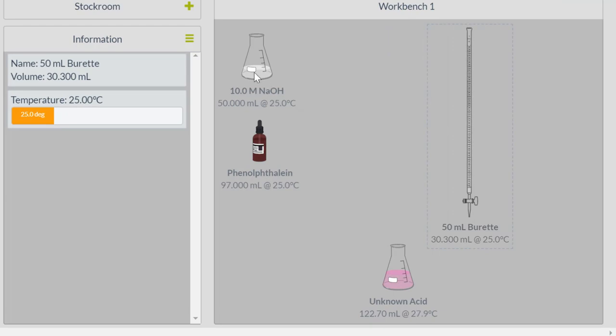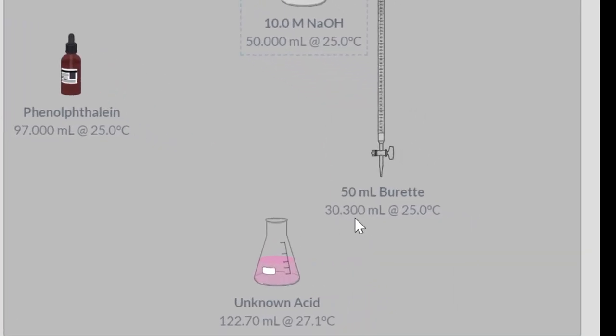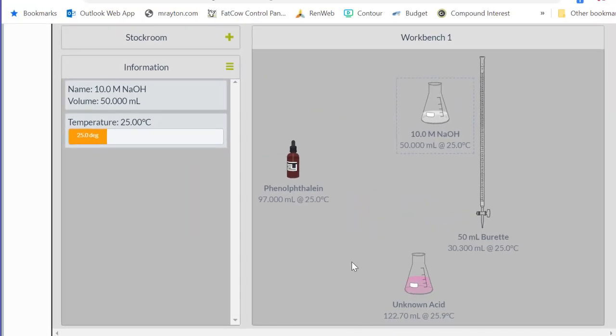You can see my 10.0 molar. I started at 50.0 milliliters, and it has gone all the way down to 30.3 milliliters. Which means you can find your change of volume of your 10 molar. I have hit my end point of my 100 milliliters of my unknown concentration. So your job is to find out the unknown concentration of your acid from your titration.